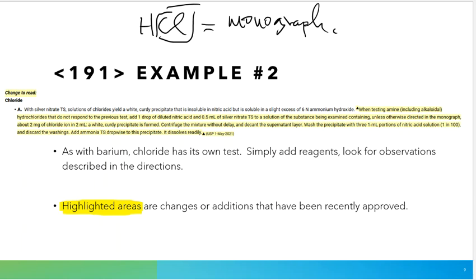So instead of writing the same step every single time, I mean, don't be like Bart Simpson on the opening sequence, right? You're not going to write down the same sentence hundreds of times, and the USP-NF is not going to do that either. So HCl is really the one that we do in our lab, typically the very first thing, and it's what you're going to see first. That's why I reference it a lot of times, but anything that has chloride in it would possibly have General Identification Test 191 referencing this step, right?